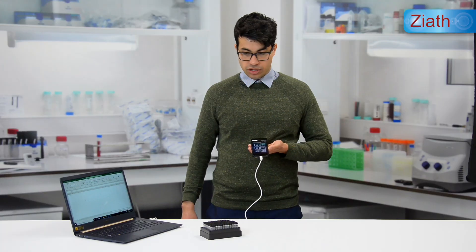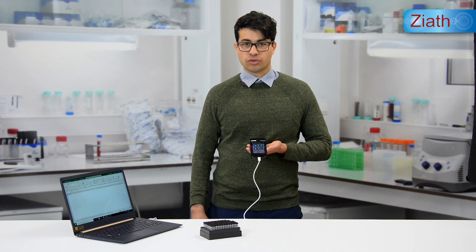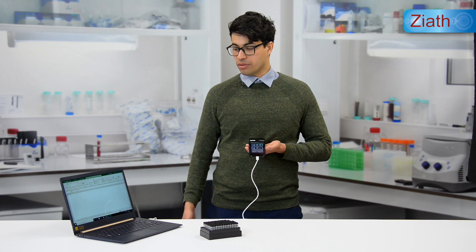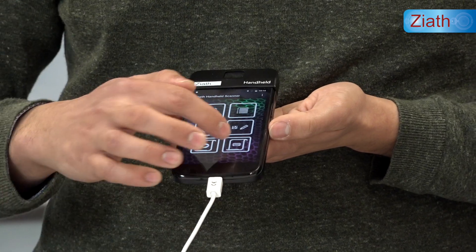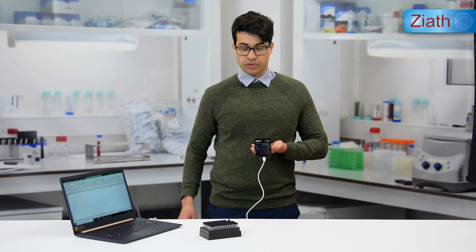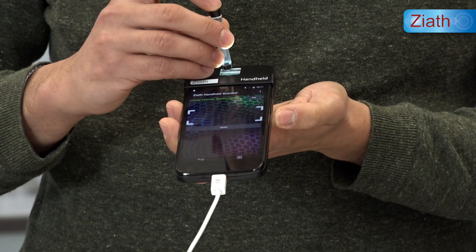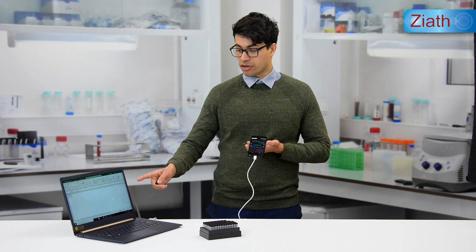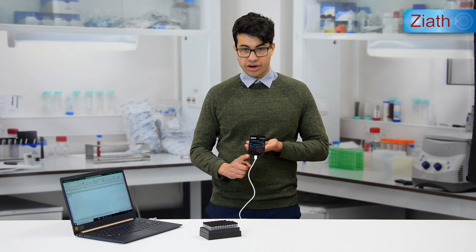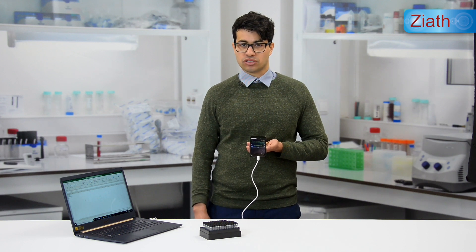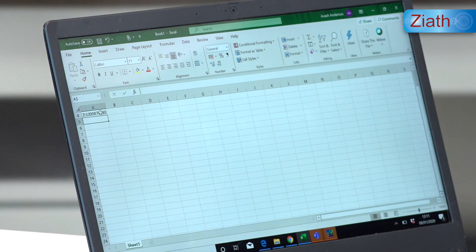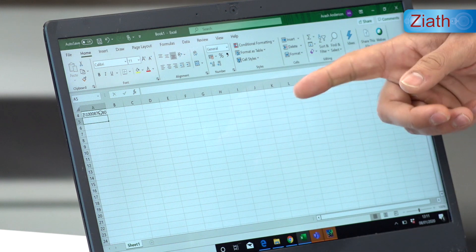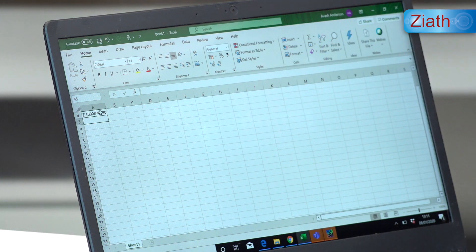For the keyboard wedge function, it will transmit a barcode onto an open on-screen application — that could be a LIM system, Excel, a Word document, a text file, and so on. If we take a tube, scan it and click send, it will put the barcode onto the open application. Note that the micro USB cable must be connected for this function to work and the handheld client must be open. The barcode has been submitted to the open application on screen — in this case it was Excel. Whatever application is open on screen, the barcode will be put there.